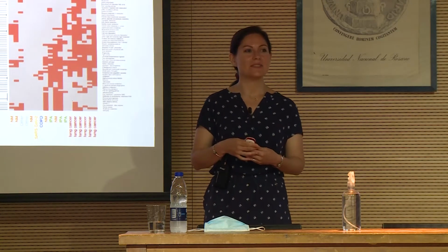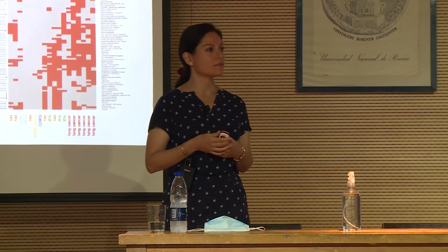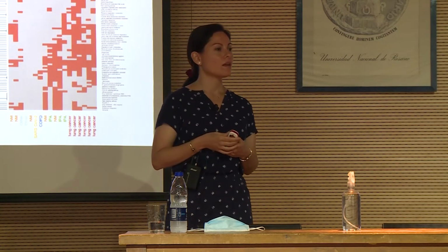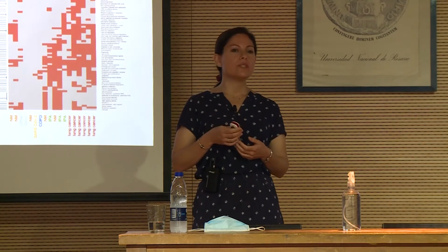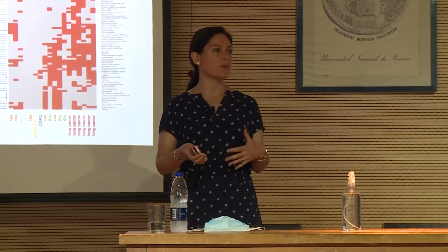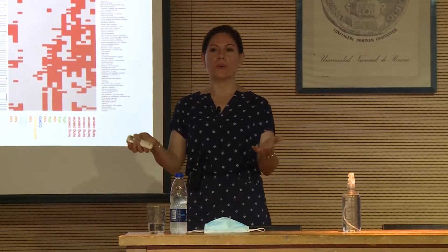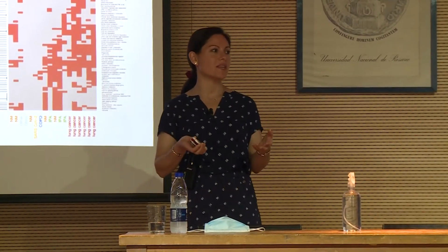Thanks. Vero, this algorithm, have you developed it from scratch, or are there previous examples of something similar to what you are doing? Well, we started with MaxQuant and Perseus analysis, the classic way to approach proteomics data.